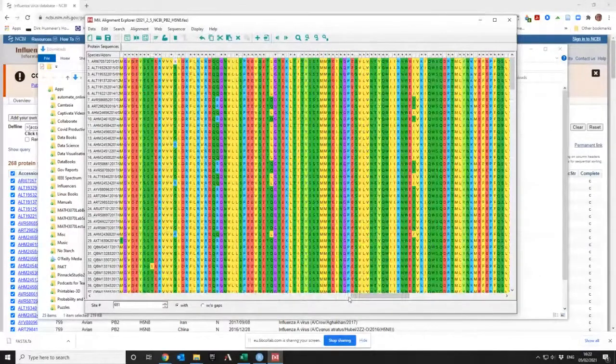So working out those evolutionary relationships, here's the LQ. Working out those evolutionary relationships allows you to work out what the ancestor looked like and how evolution has evolved the sequences along the different branches. And this allows us to construct trees. And that's what we're going to do for a lot of the module. Tree construction and alignment.